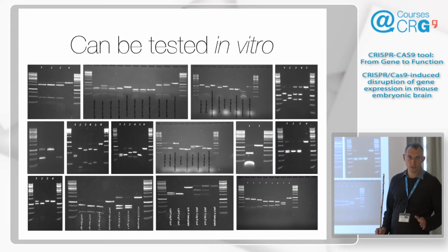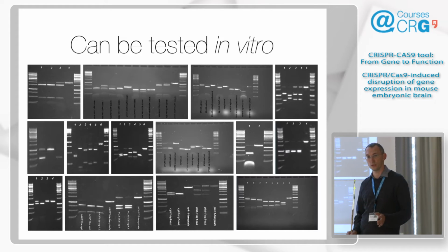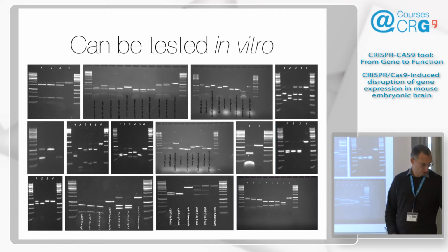So some people consider this unnecessary, but if you're working with mice where you have to wait 6 weeks to see what happened, it is quite useful to know that your reagent is functional, and we do it every time because it doesn't really cost much time or expense.